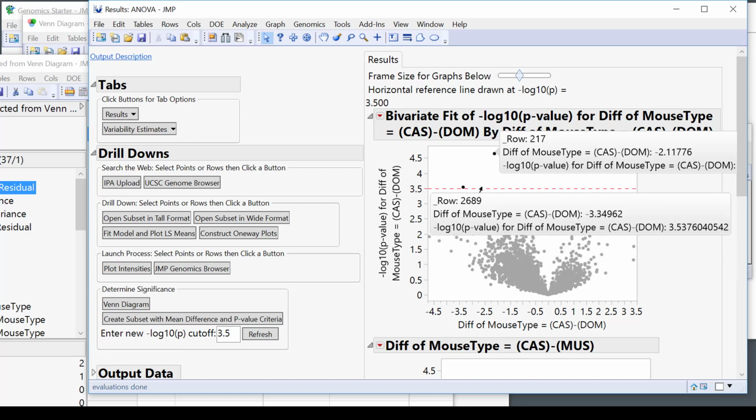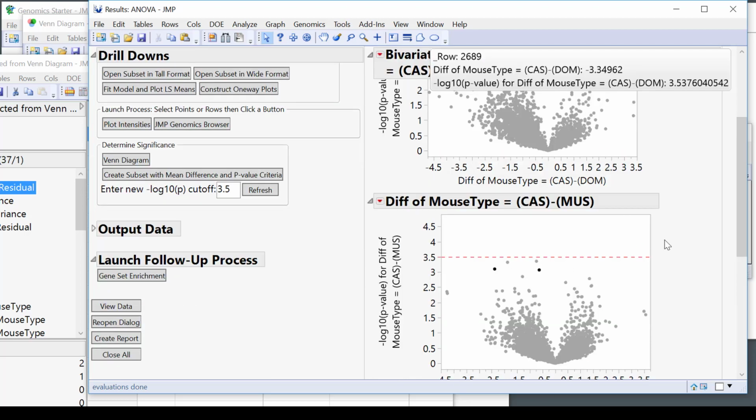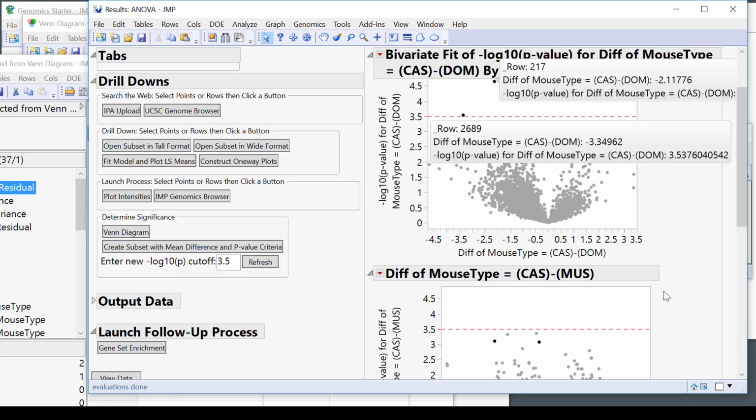Maybe I'll move this guy down here. So if this is the final picture that I want, I can also change the colors of things, change the axes, put more markers in here, put more labels. There's tools up here. If I wanted to annotate something, I could click annotate and put a little note in here and have it say something.